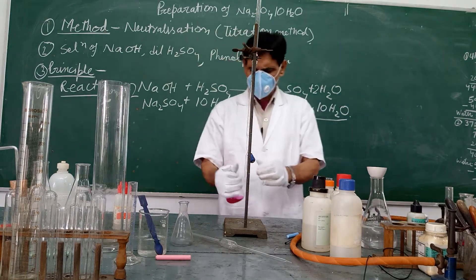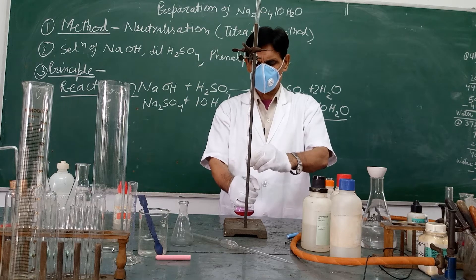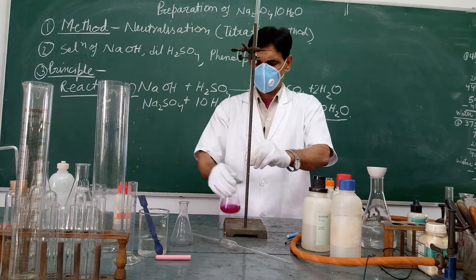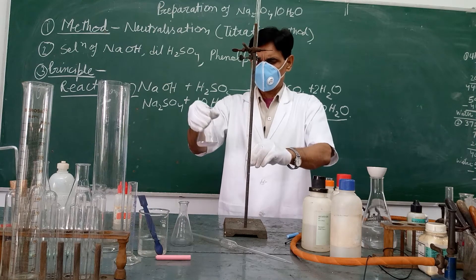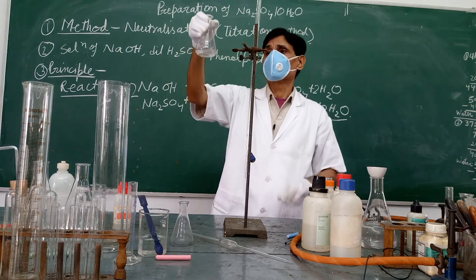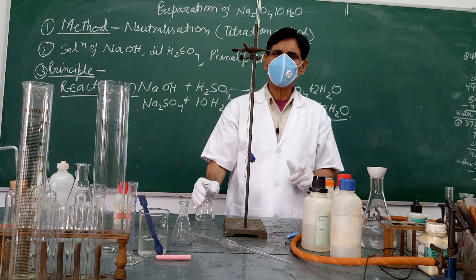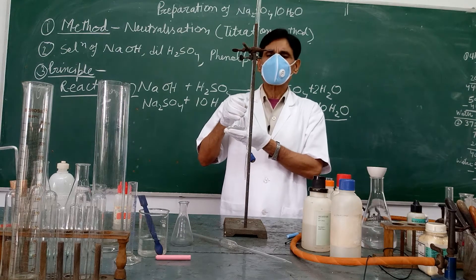Now I am adding this solution drop by drop with constant shaking until the pink colour disappears. I add the acid with constant shaking, drop by drop — do not add it suddenly. The pink colour disappears here. This is called the end point — the stage at which exactly the NaOH solution is neutralized by H2SO4, and none of the components is in excess.